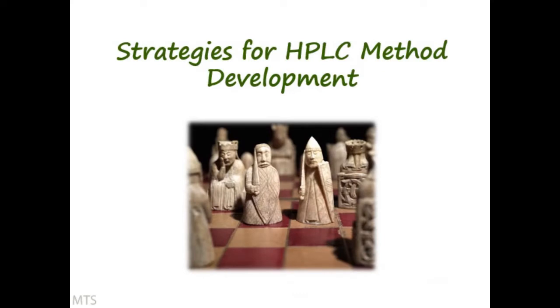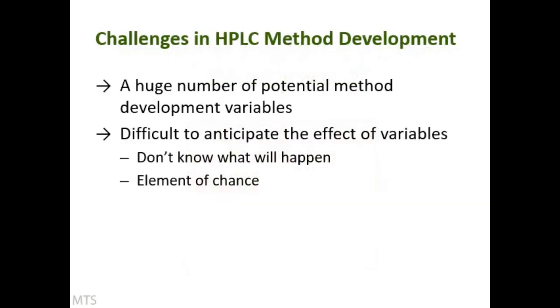And I think one of the things about a strategy is that it gives you a plan, doesn't it? And I think the benefits of that in method development are very straightforward, so I don't have to sell you on why we use a strategy. I think we would like something to help us get to where we need to be. So let's have a look at the challenges that give us the need for the strategy.